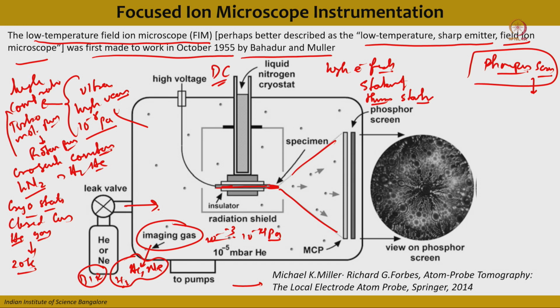Now in the new FIMs, in front of the phosphor screen, they use another plate called an MCP plate, a micro channel plate.